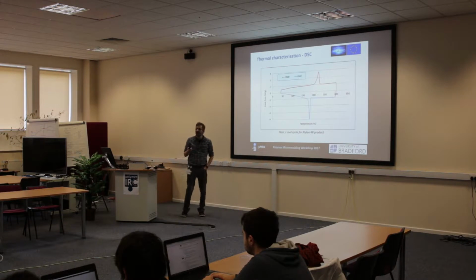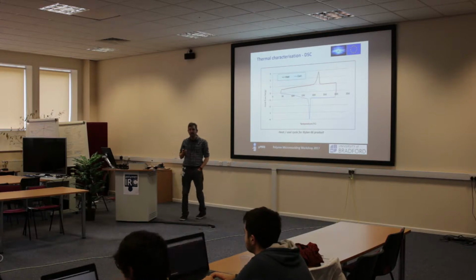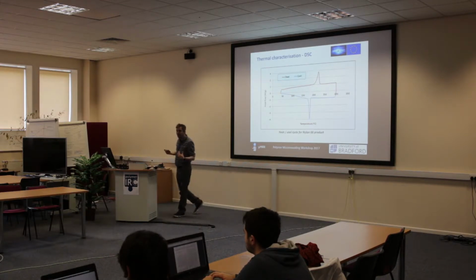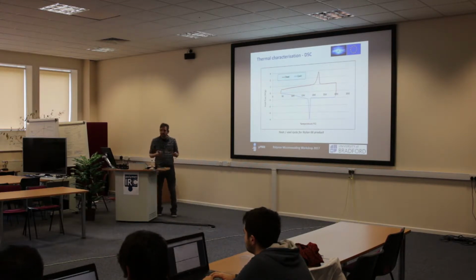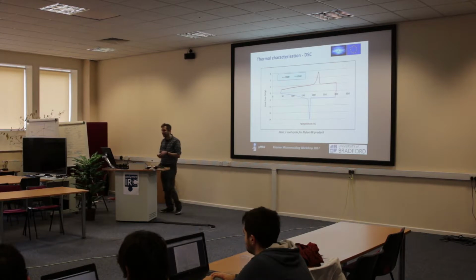The reason we can see it is due to the concept of latent heat. Have we come across latent heat before? So you have a heat of fusion and a heat of crystallization, which is either additional energy required to form bonds or to take away bonds. So with water, if you heat it up to 0 degrees, it doesn't melt straight away. It takes extra time and extra energy to break the crystal bonds. So it's what's called an endothermic peak, and that's what this measures here.